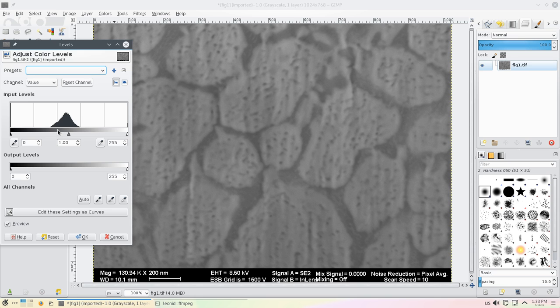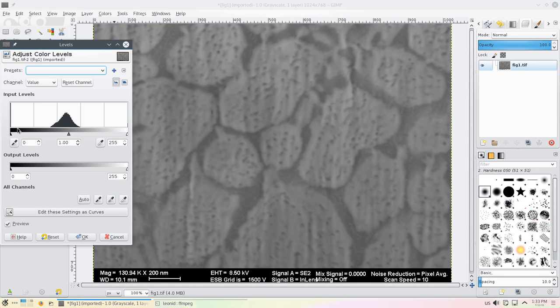We can see that the main density of the pixels is somewhere in the middle, which is good. It's supposed to be this way. Well, it would be better if it would last from one end to another, but it's better than overlapping the edge.